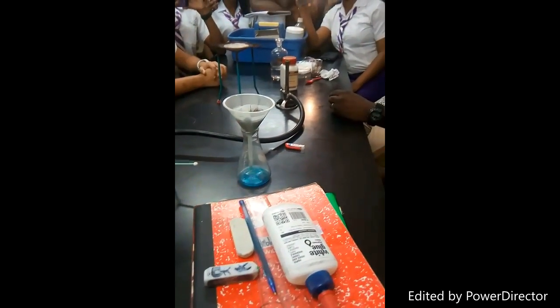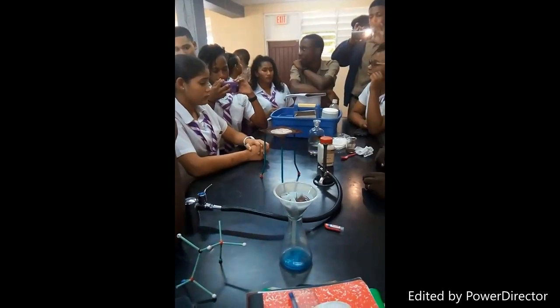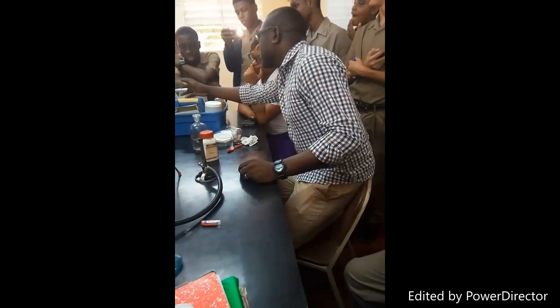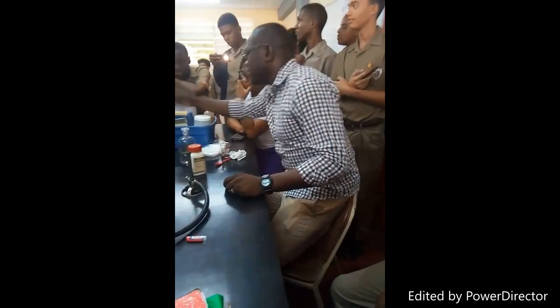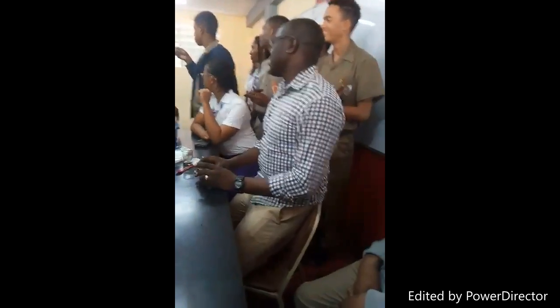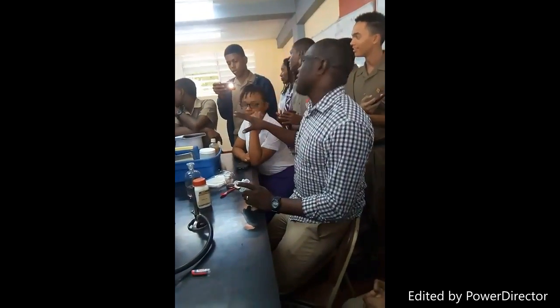Then now we're going to turn our attention. Look, over there you see a bottle marked potassium iodide, KI. You don't see KI anywhere? Potassium iodide, right there.